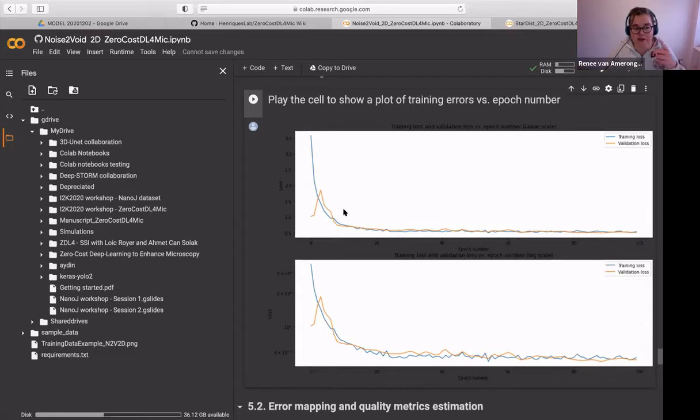Yeah, because I already noticed that my training and validation was vastly different, much more different than yours. So that's probably then why they don't meet in the end. Yeah, exactly. Do they both look like they're going down, plateauing? Yeah, they both slowly plateau, just at different levels. Then that's all you need to know at that stage. Okay, yeah, that's clear. Thanks.